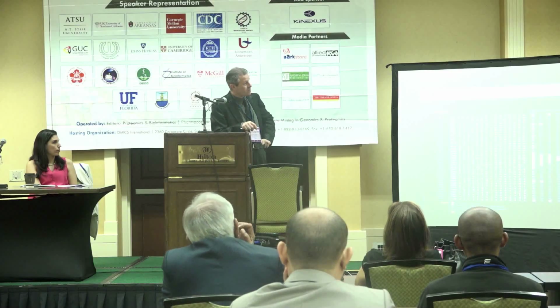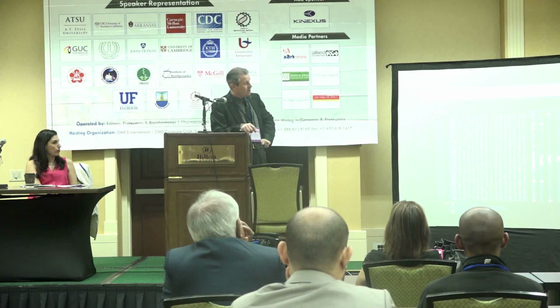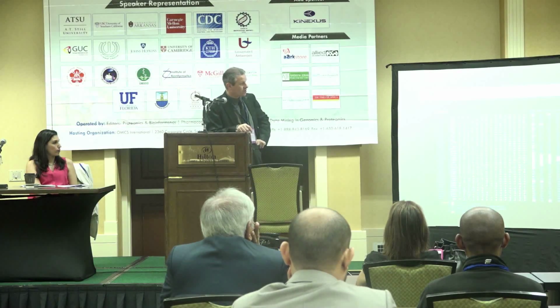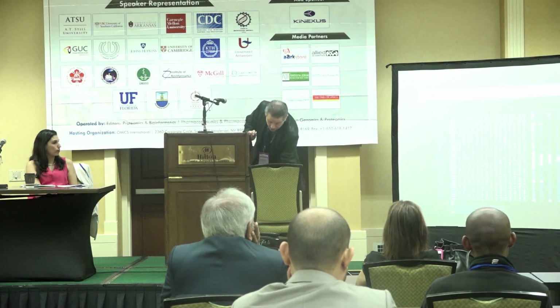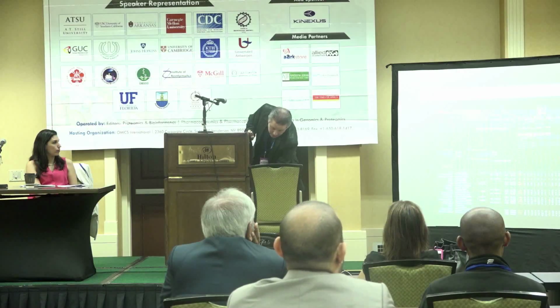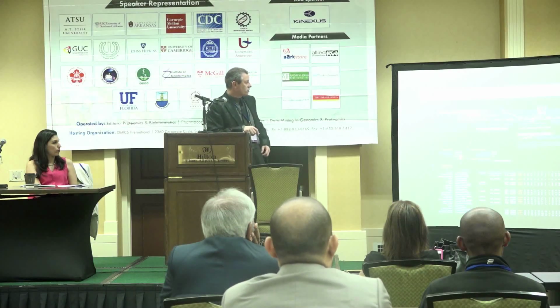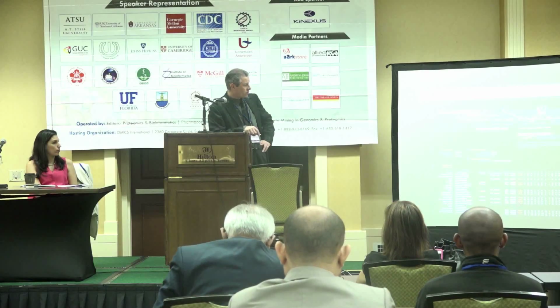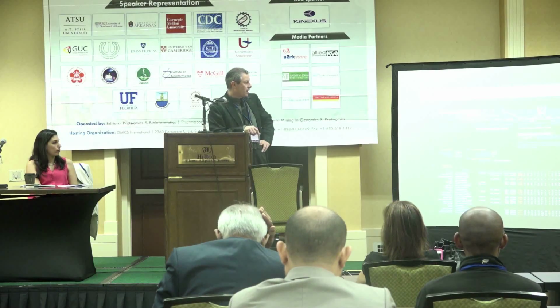But then these orange buttons, they take you to additional modules where you can get the evolutionary information, or the kinase prediction, or the phosphorylation site matches for those individual sites, depending on which button you click. So if you went to PhosphoNET Evolution, you would get in the 20 different species, the sequence, the actual phosphorylation site number, and there's a listing of its overall conservation scores.